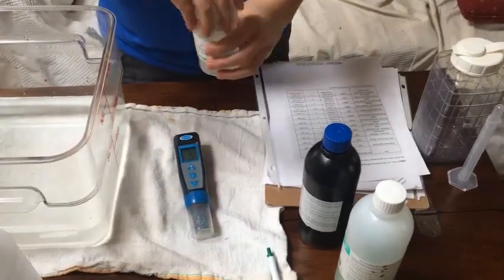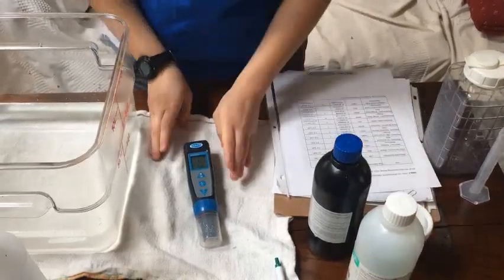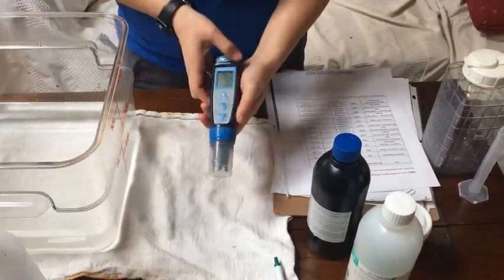Again, it's every single time you go out. You don't need to do it in between sampling, but you do need to do it before your day starts.